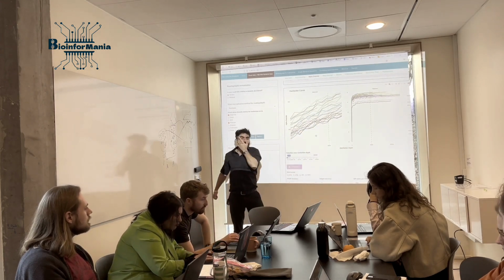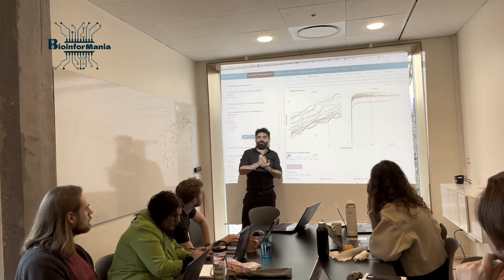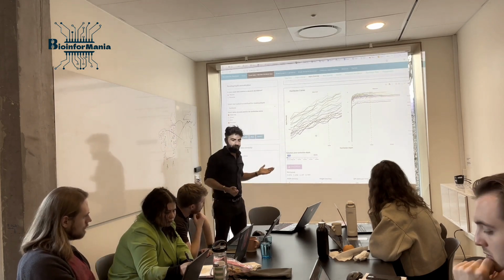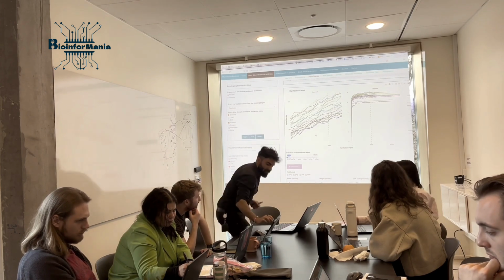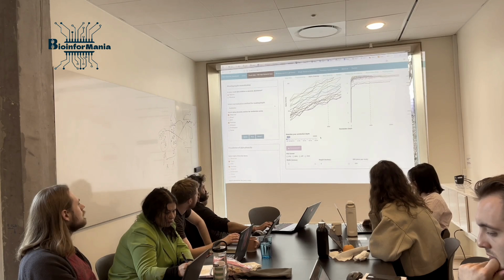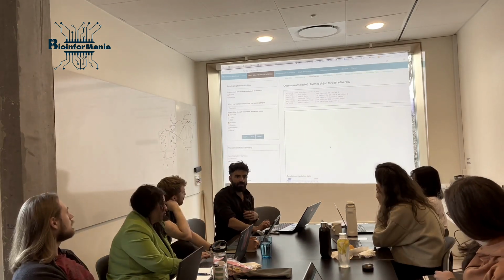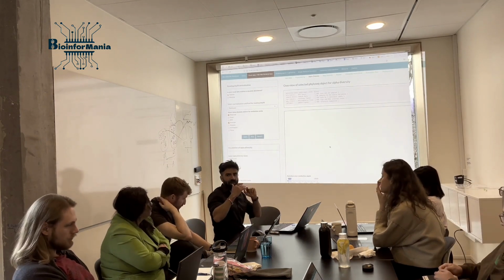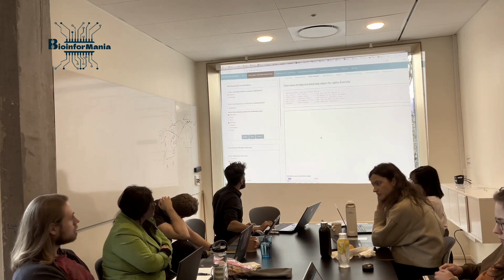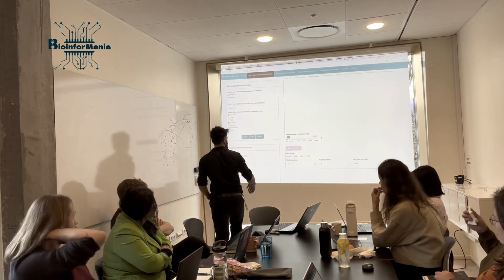You need to look. Again, rarefaction is not recommended for pilot studies or for samples coming from rare conditions, okay? Don't do this. Now let's say that we chose rarefaction and hit apply and look at the distribution before and after rarefaction. Rarefying doesn't actually influence the distribution of your data as such, the skewness, the tail of your data. When I click on apply, you can see that it doesn't really influence much.